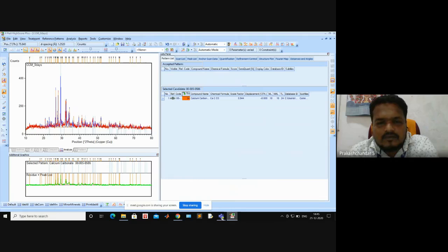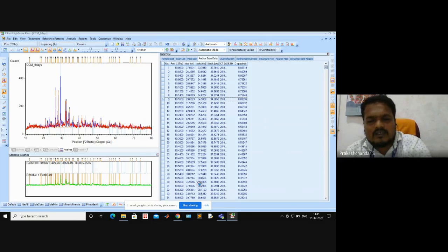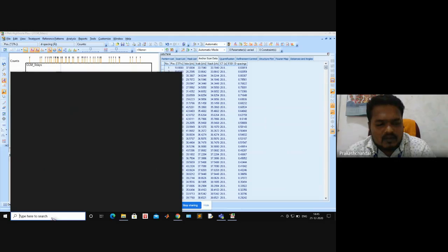Okay, so now go to anchor scan data, right click anchor scan data and copy the list. You can make a copy. Open Excel.